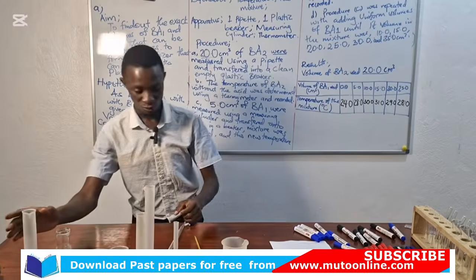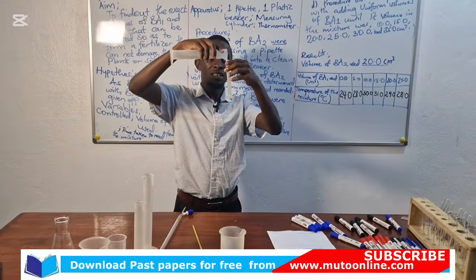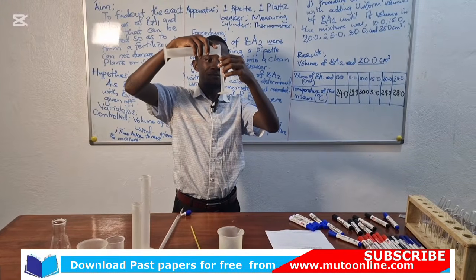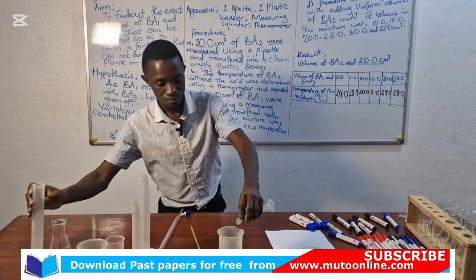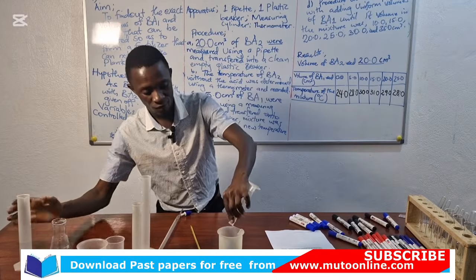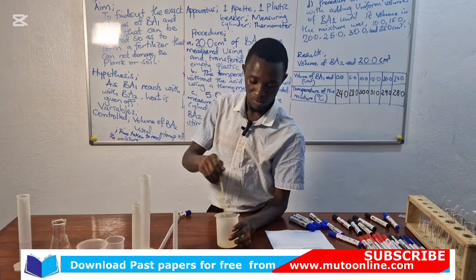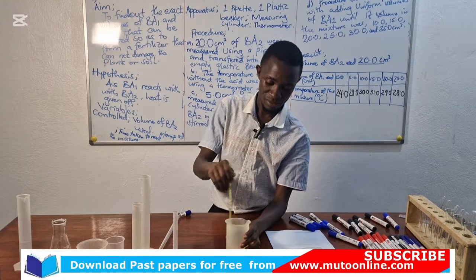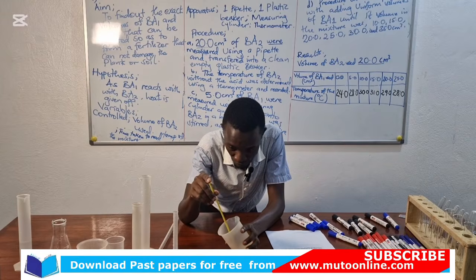We still have the solutions. We still have BA1. Let's add more 5 to make it 30. So I've added more 5. So I'll stir the mixture. Stirring. I'll give the reaction time to proceed.